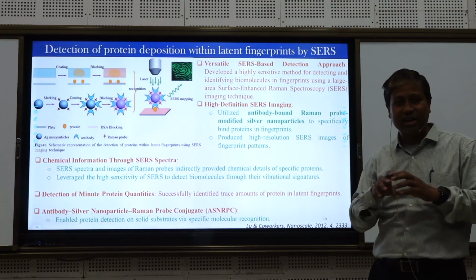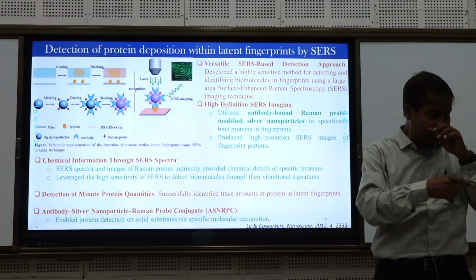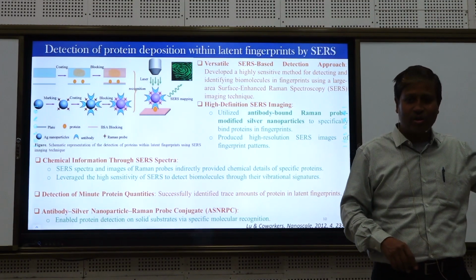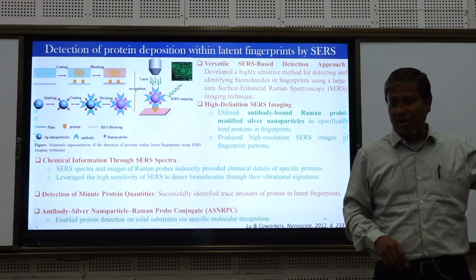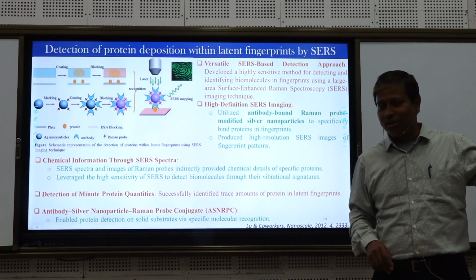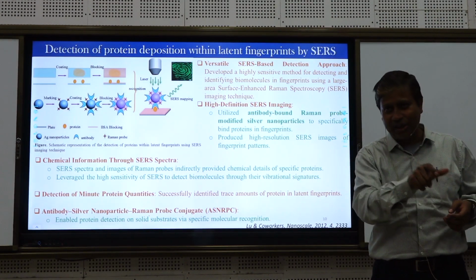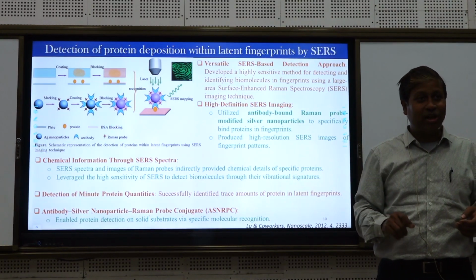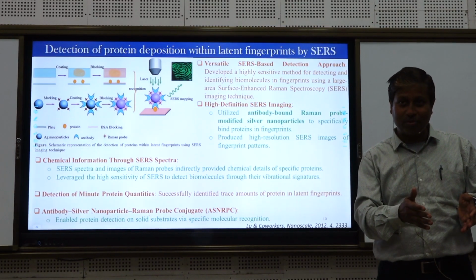Many spectra today also will appear as if there is no change. Yesterday I noticed that when Professor Hiramasu was recording the glucose solution, he felt it was water. He initially thought it was water because of the strong water band, the OH stretch and then the bending. Then when somebody told him this is a glucose solution, he immediately became careful, because it appears like a water solution.